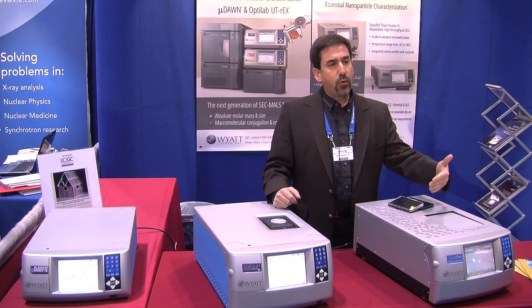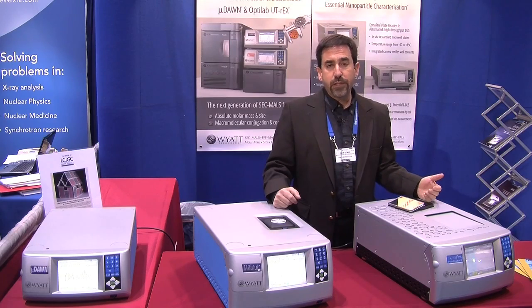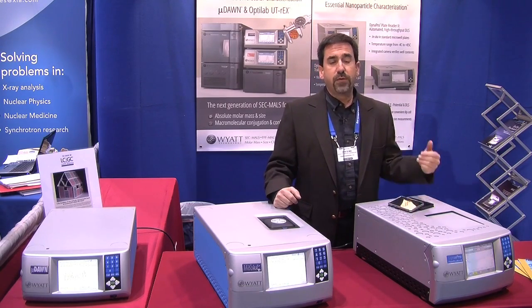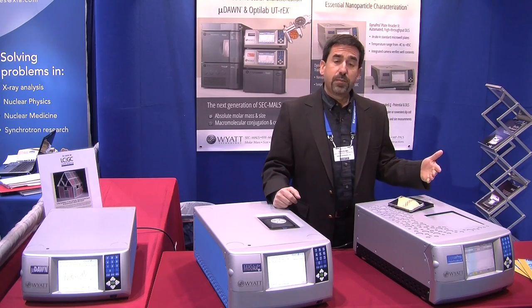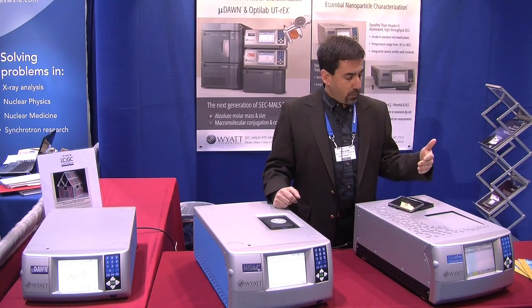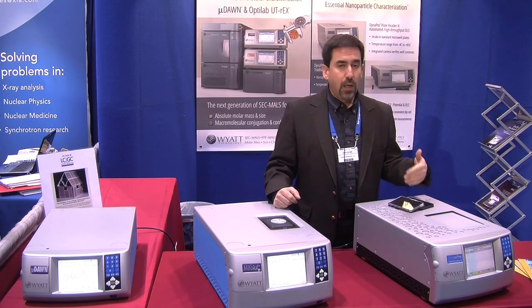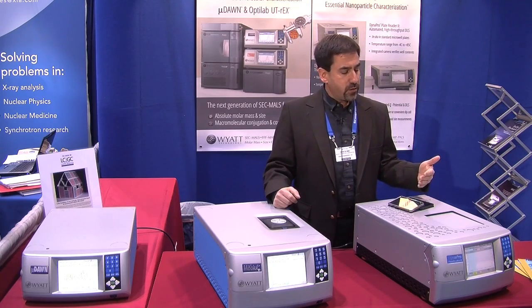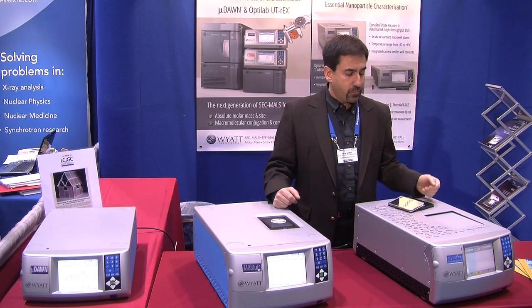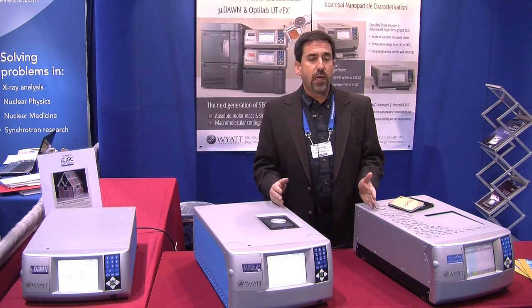The Dynapro also allows you to ramp the temperature. So for instance, if you want to characterize the melting temperature of proteins, it can do that, and you can simultaneously measure all these different formulations. Many other capabilities of the plate reader include characterizing colloidal stability, through the second virial coefficient and the diffusion interaction parameter, aggregation, and size distributions for particles, aggregates, macromolecules, and proteins. So this is just a selection of some of the instruments that we have.